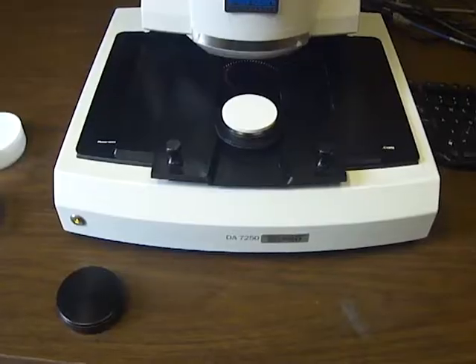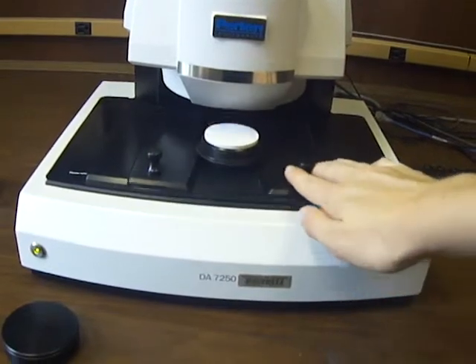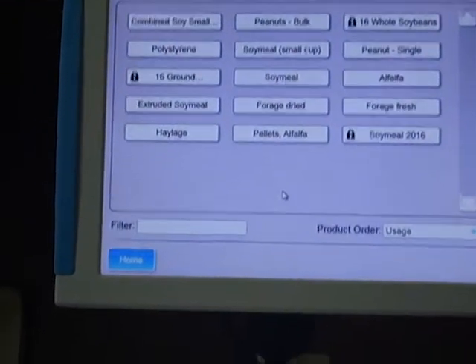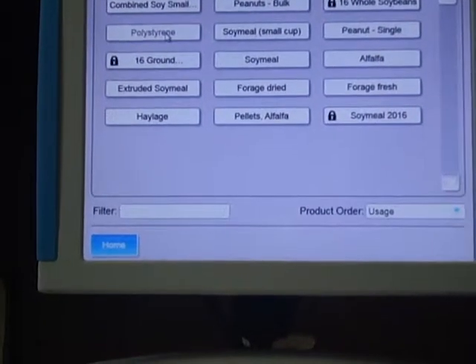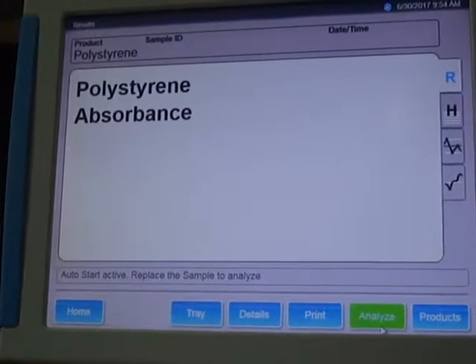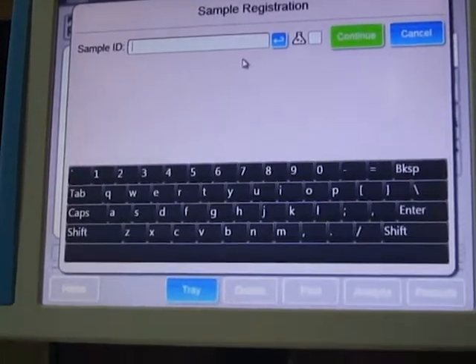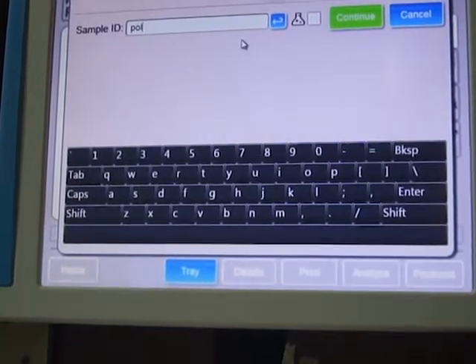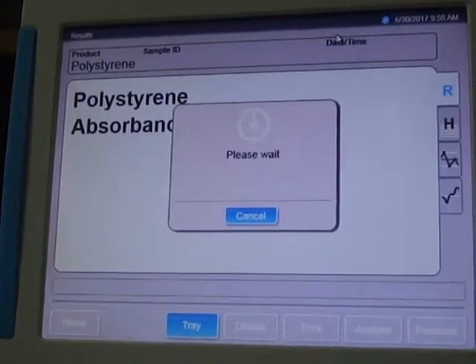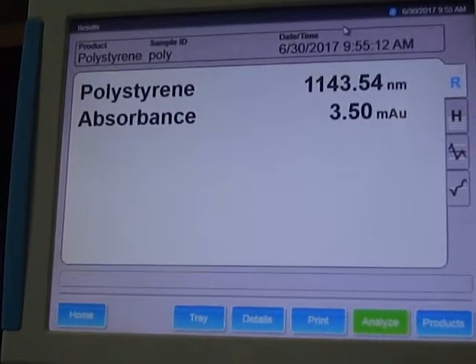Next, place the polystyrene block with the cover removed onto the tray and slide it under the light. On the product screen, click polystyrene and then click confirm to let the machine know that the tray is in place. Click analyze and the machine will start reading the sample. Enter poly into the sample ID bar and click continue. The polystyrene block should read around 1143.6 nm. If this is the case, the machine should be calibrated and ready to read samples.